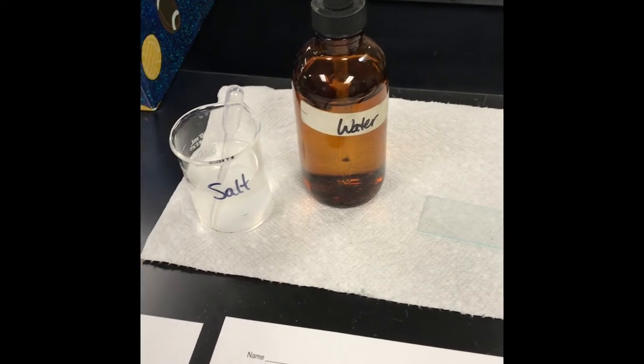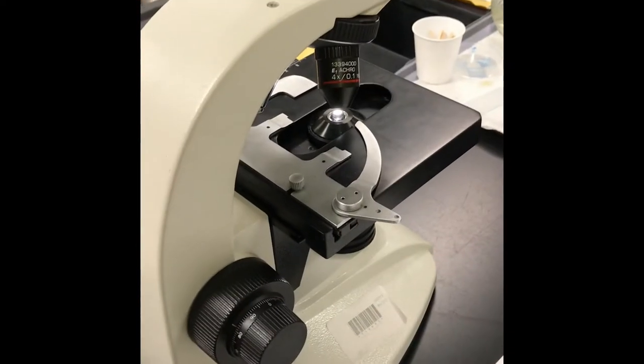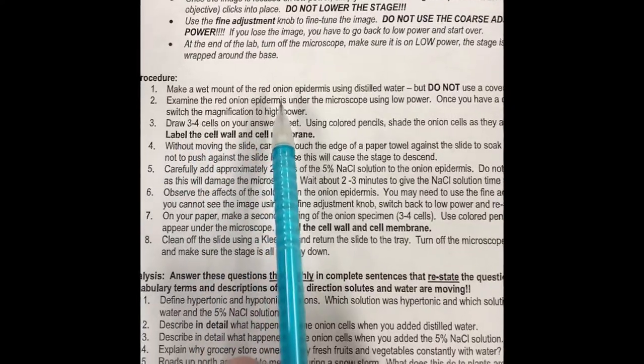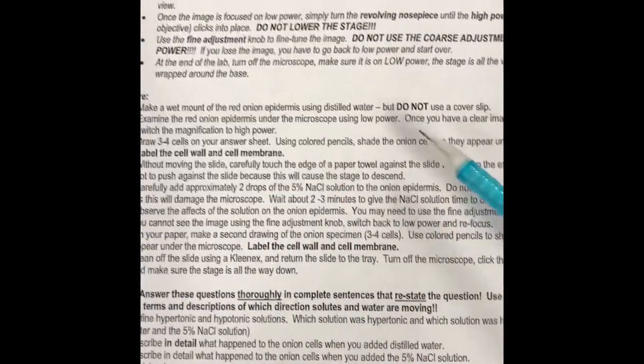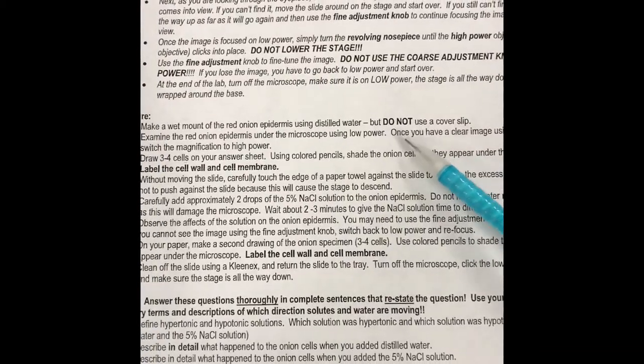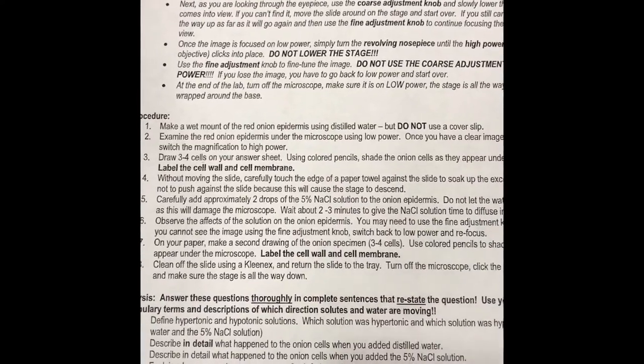The first thing we're going to do is start at step number one. We're going to make a wet mount of our red onion epidermis using distilled water, but we're not going to use a cover slip because we want to see this in action. If we put a cover slip, we won't be able to use salt water right after.